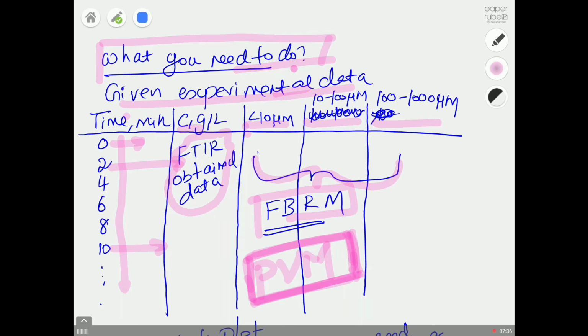You can imagine, if this is a frame with one crystal, two crystals, you can draw a line and check the length of the crystals if you want to interpret manually. So these snapshots will give some idea about the resolution of the images that we get from the PVM technique.